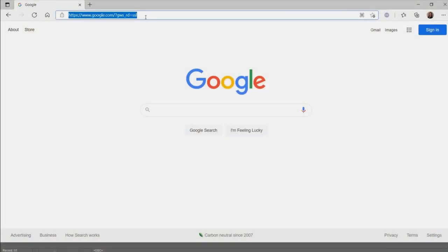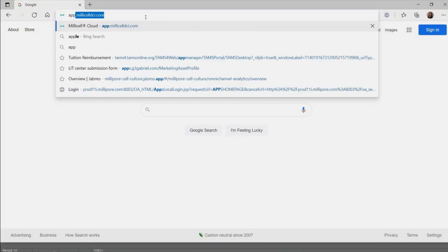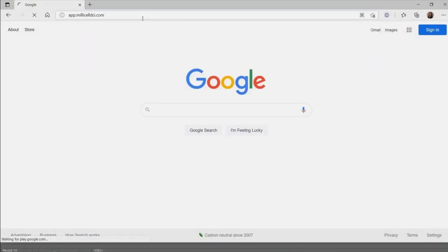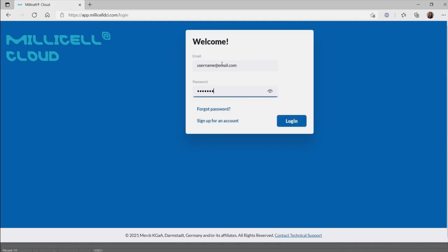In your web browser, navigate to our website. For the best experience, we recommend using the latest versions of Google Chrome, Microsoft Edge, or Apple Safari browsers. Enter the username and password provided to you in the welcome email.